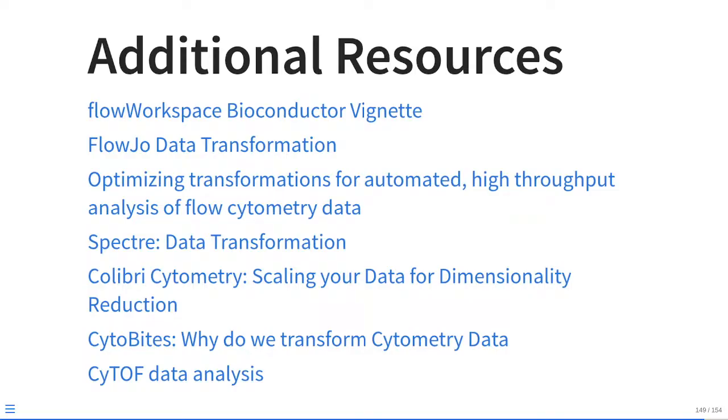The additional resources section, the focus of today was very much more of how to go about applying the transformation in R, because that's the section that can be a little convoluted. Now, what is the best transformation? What's the best arguments for your intended purpose? That's something we can't really address in a general manner, but fortunately, this is an area where a lot of the existing resources are already present and are quite good places to start.